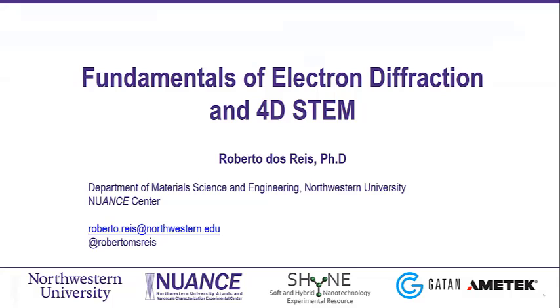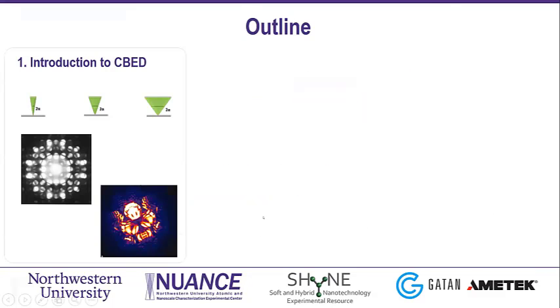So the first topic today is fundamentals of electron diffraction and 4D STEM, right? We have a very diverse set of attendees here. So what I want to cover first is the introduction to convergent beam electron diffraction. That's the main technique that we use for 4D STEM under scanning transmission electron microscopy mode.